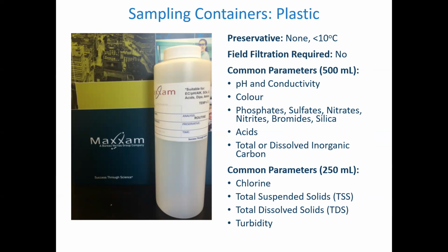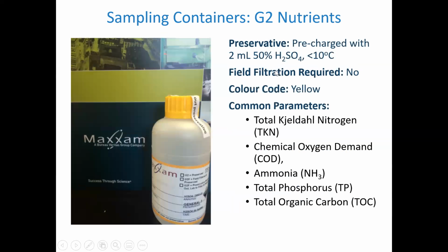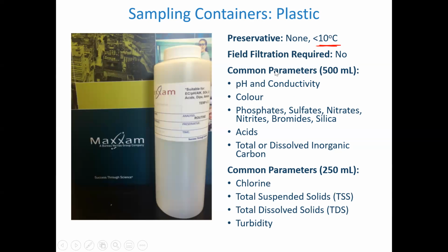Again, the volume sometimes is important depending on what the lab is looking at. You can see it's not requiring any preservatives. It's just saying less than 10 degrees. So typically it's assumed if you have something on ice, it's about 4 degrees Celsius, the sample anyway, not the ice itself. So that's your typical bottle. The other thing is, in a lot of cases, they're saying don't leave any air up there as well. Again, it depends on what you're testing for, and that's always a good question to ask the lab.